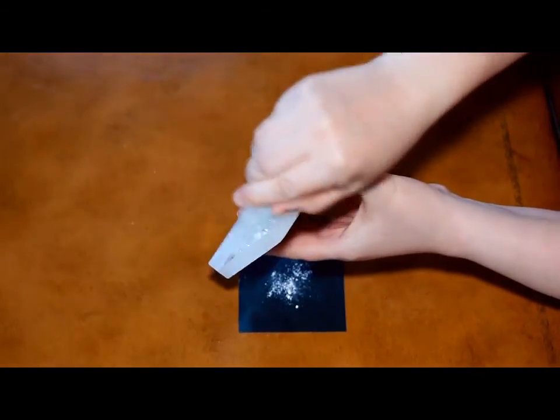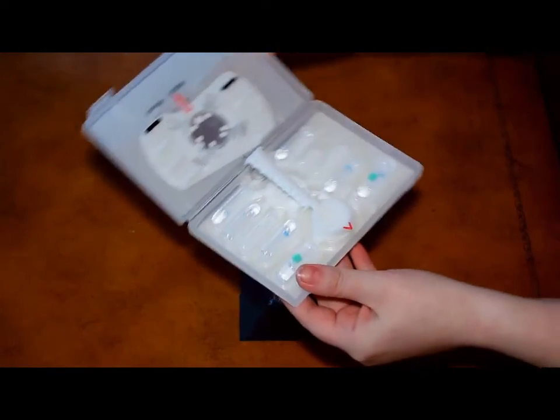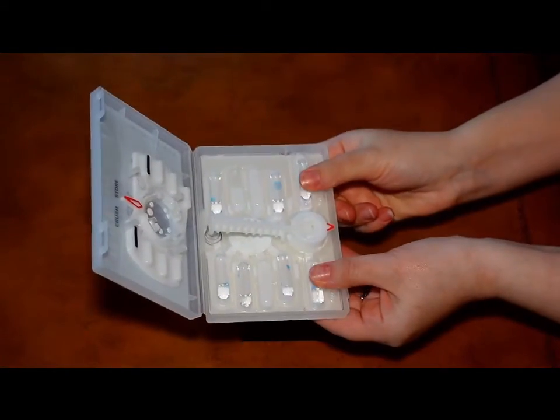Now, open the case of your detection kit and press the green dots to crush the wetting ampoules. Wait 10 seconds.